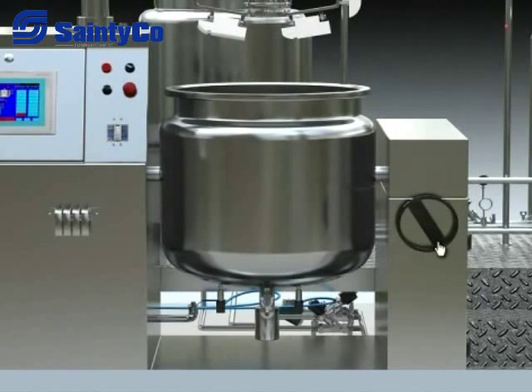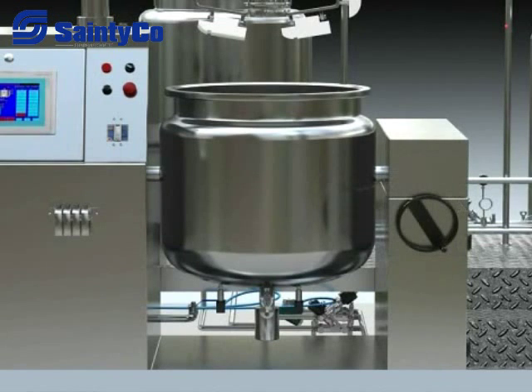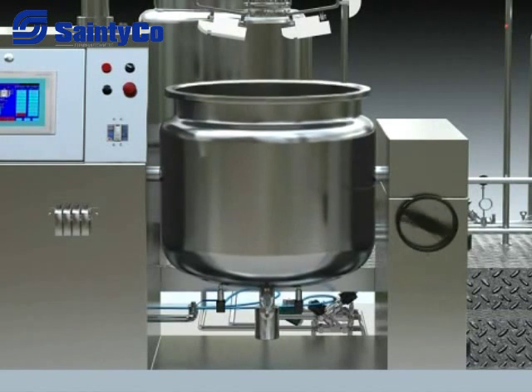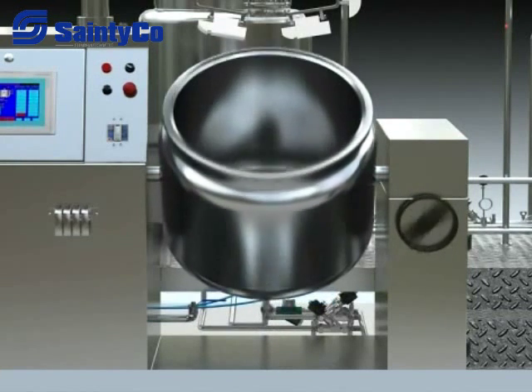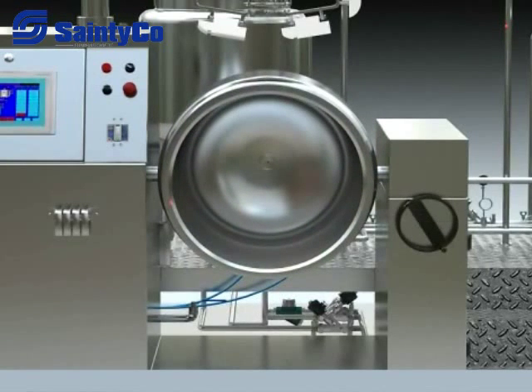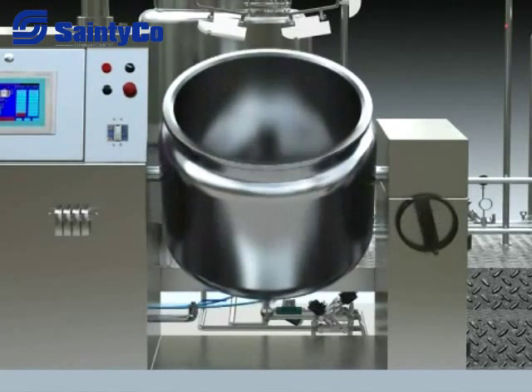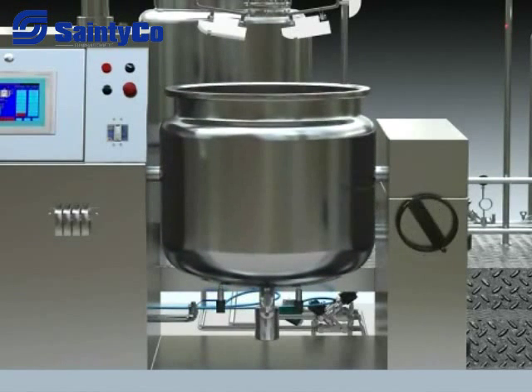4. Discharge system. It is made up of a discharge handle wheel, worm screw, and worm wheel. When the emulsifier reaches the upper limit, swing the discharge handle wheel forward until the tank tilts so that the upper end is lower than the bottom — the discharge limit. Then reverse-swing the discharge handle wheel and the tank will reset to the normal state.